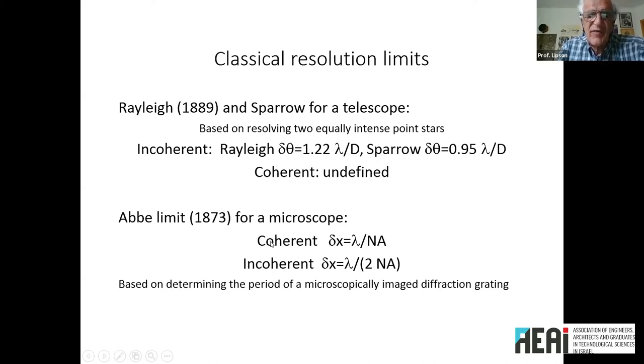Coherent light gets reflected off the lens elements and the tubes and so on, and then interferes with the light in your image, and that's a nuisance. Whereas incoherent light doesn't interfere, so it may give you a little bit of background, but it's much less troublesome because it's more uniform than in the case of the coherent. So incoherent light is ideal for microscopy, and that's what we're going to talk about.